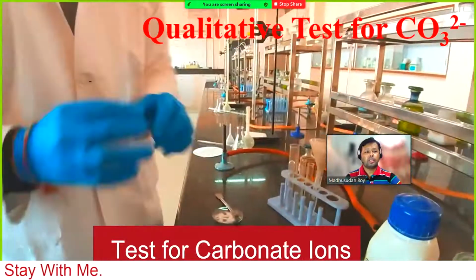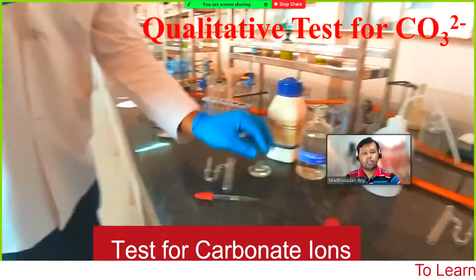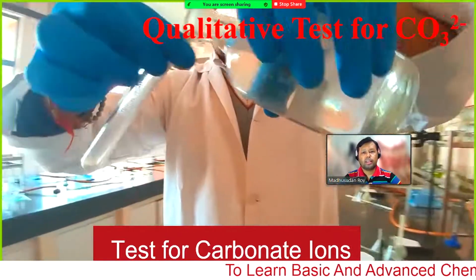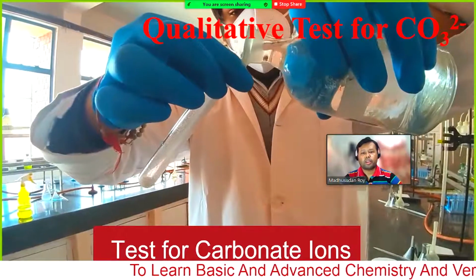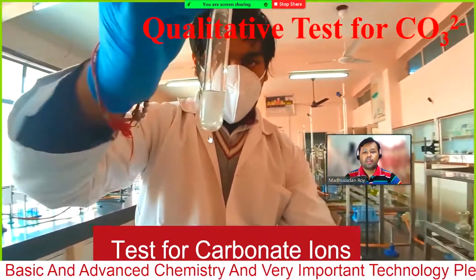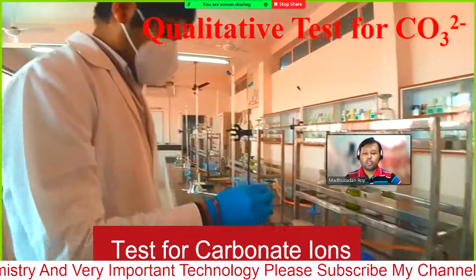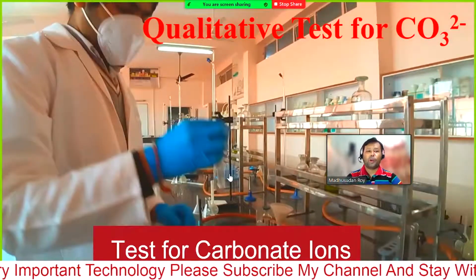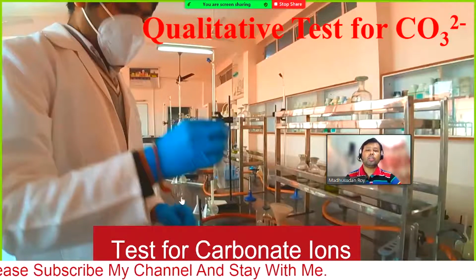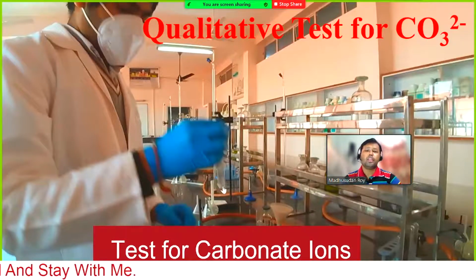Then add dilute hydrochloric acid. Now observe what is going on. Here you can see effervescence. So we are getting the effervescence, but it has already finished. So you cannot test this way. That is the difficulty. If you add carbonate salt and add the acid, immediately it will react.